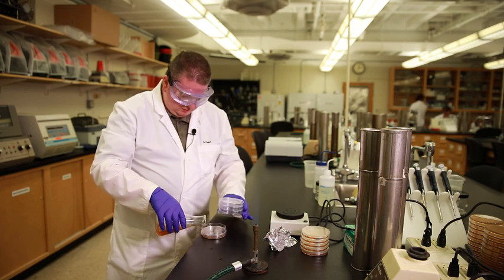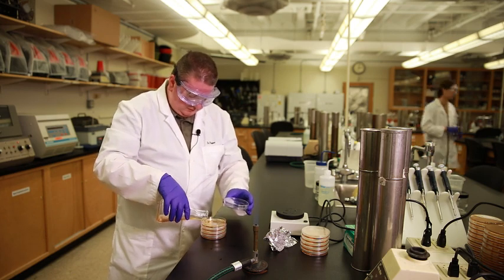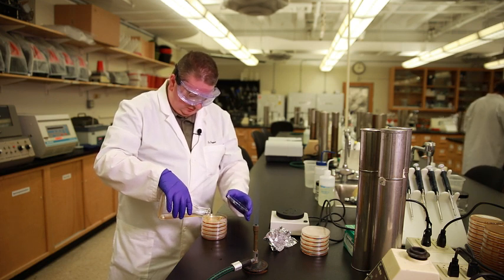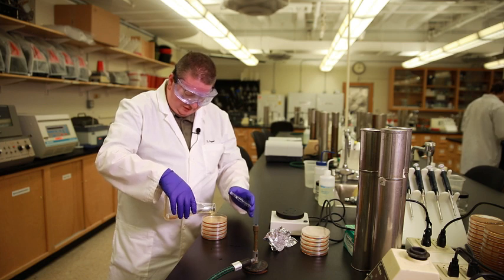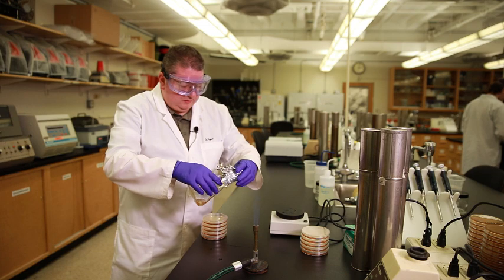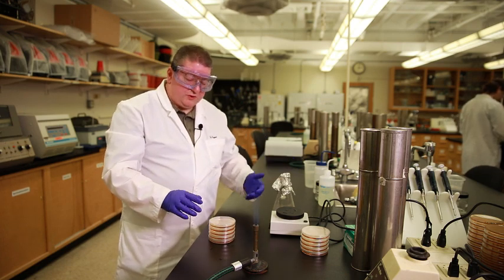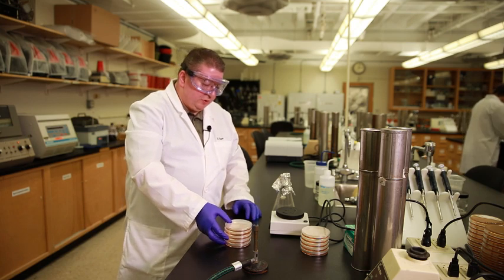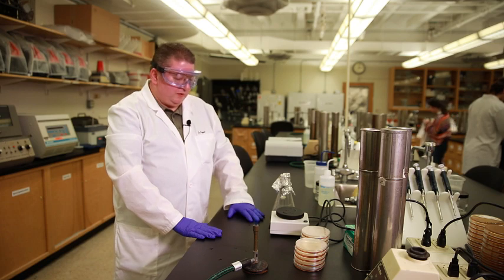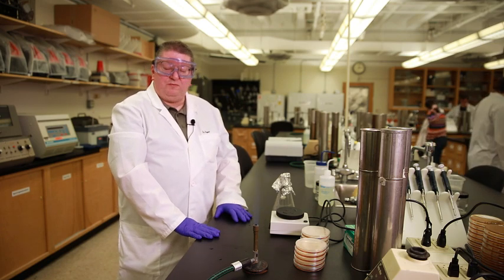1, 2, 3, 4, and our last dish. And we want to make sure we pour slow enough that we don't lose our stir bar into that last plate. Put that right there. Now this flask will get flushed out to remove any residual agar. The plates, we just push them away onto the bench, and then we are finished pouring these plates. These plates will be ready to use in about 24 hours, so a student can have them for their project.